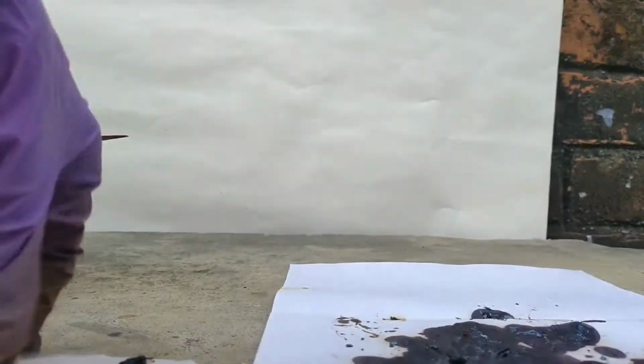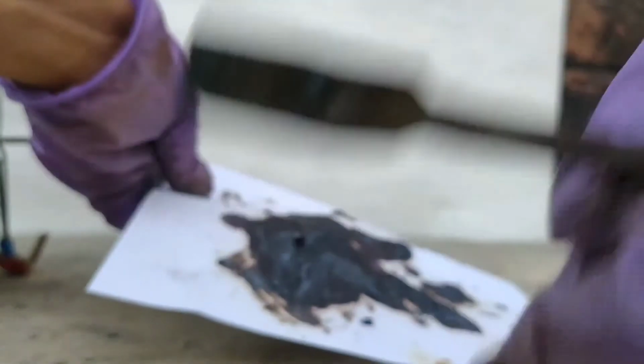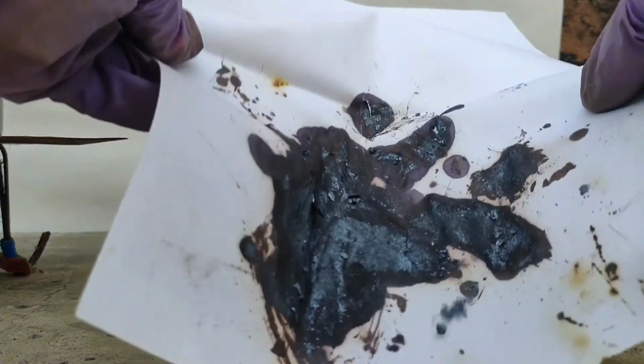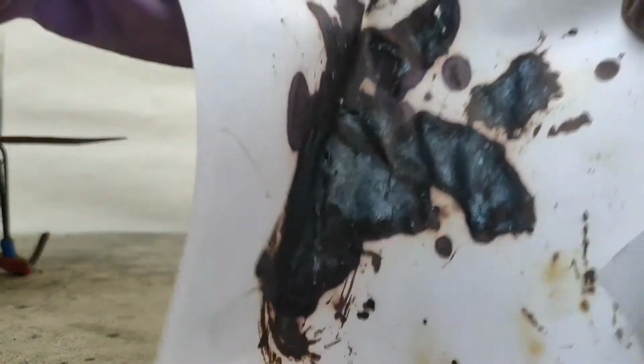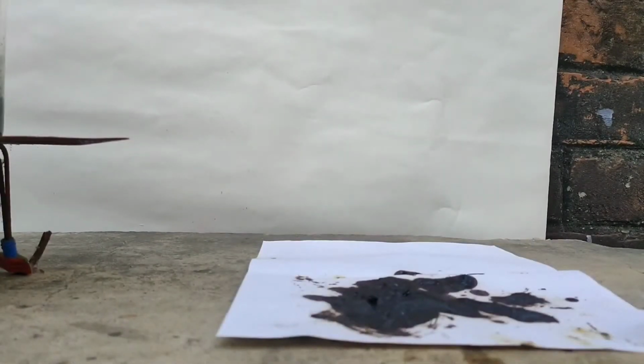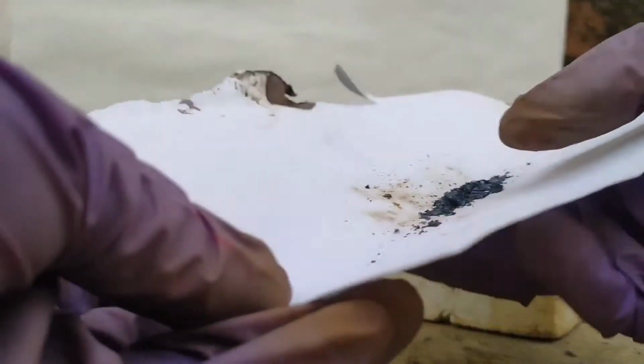I tried to scrape off as much of the iodine as I could get from the paper, but the paper started disintegrating. So these were the crystals that I have got after drying.